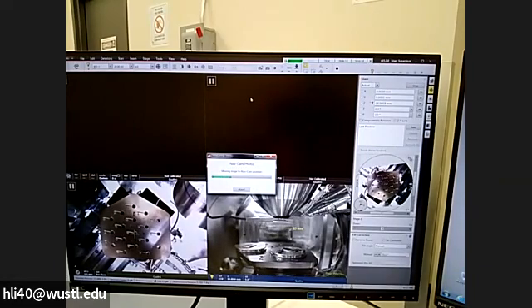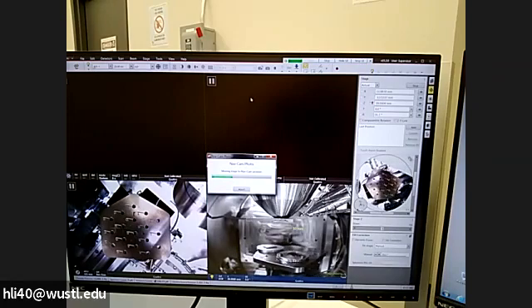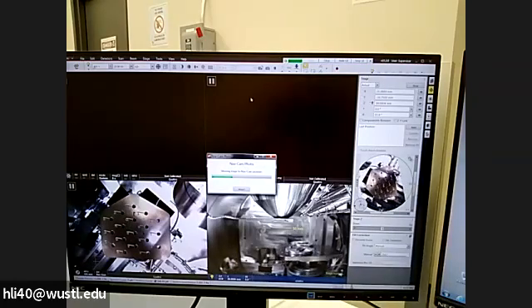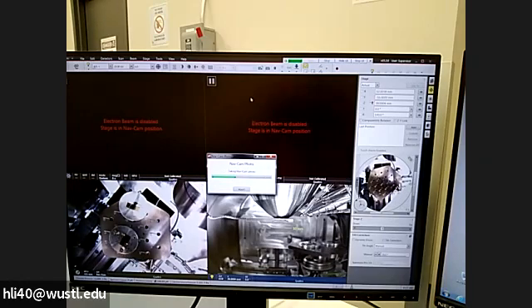During this process, all you need to do is just wait. Don't interrupt this process. It takes about 1 minute.